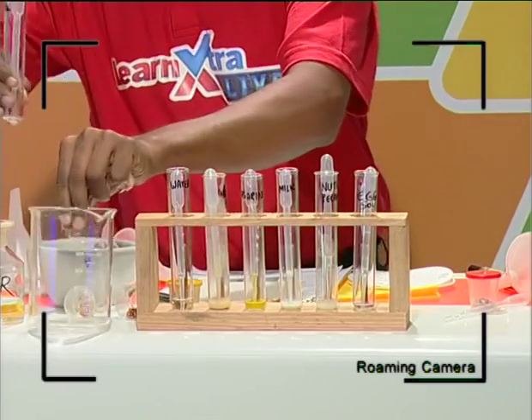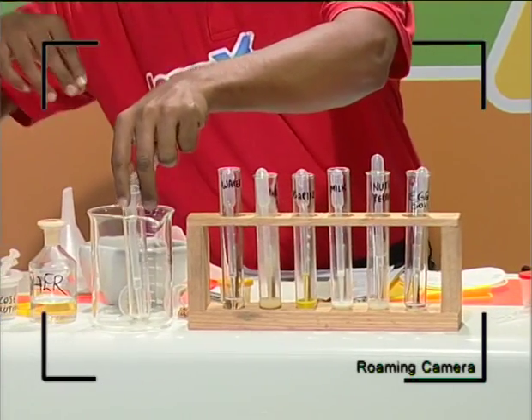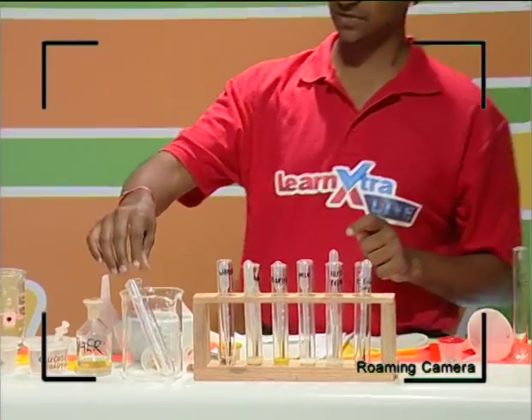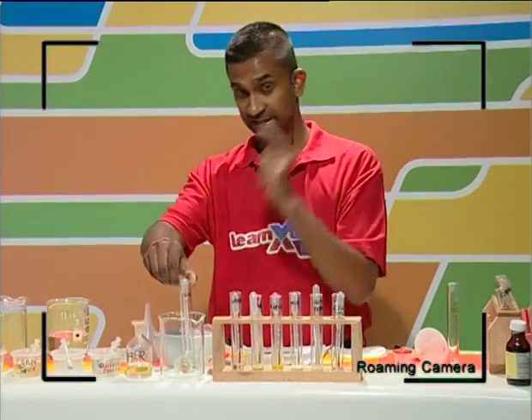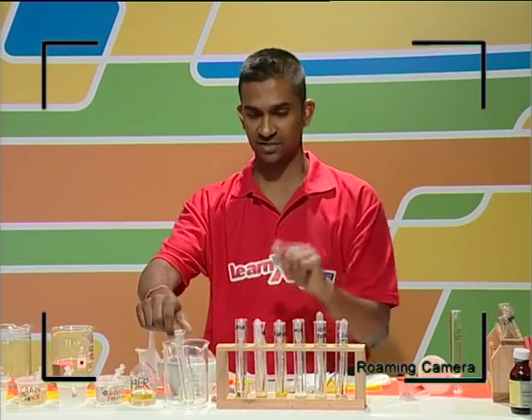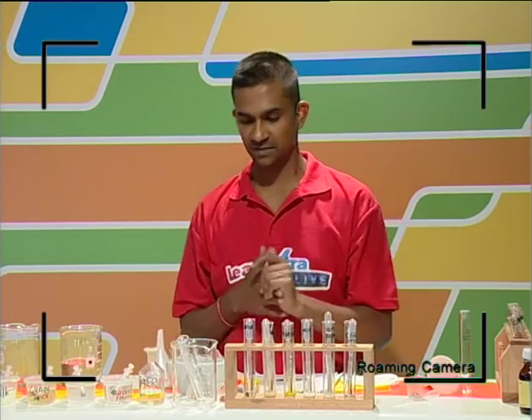I'm going to place this right here in the front because I didn't have enough place on my test tube rack. But this is oil, and you know that oil is our positive control, which will definitely indicate the presence of a fat. We have water, which definitely does not have fat, so these are our positive and negative controls which we're going to compare results to.